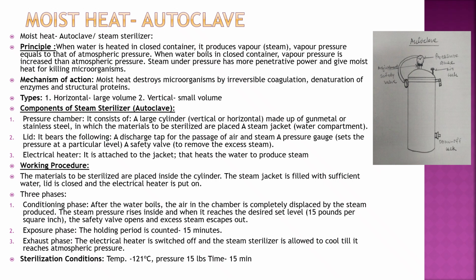Exposure phase: the holding period is 15 minutes. Exhaust phase: after the holding period is over, the electrical heater is switched off and the steam sterilizer is allowed to cool till it reaches atmospheric pressure, and then the material inside is removed.